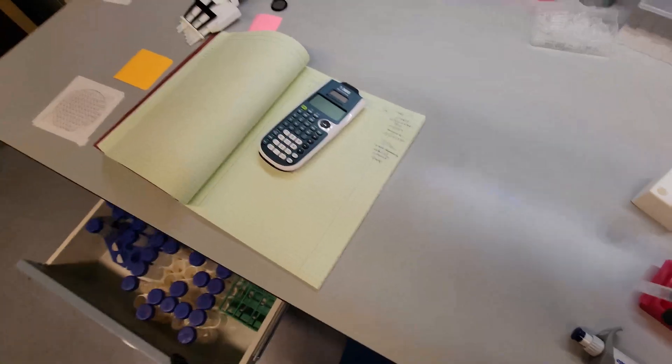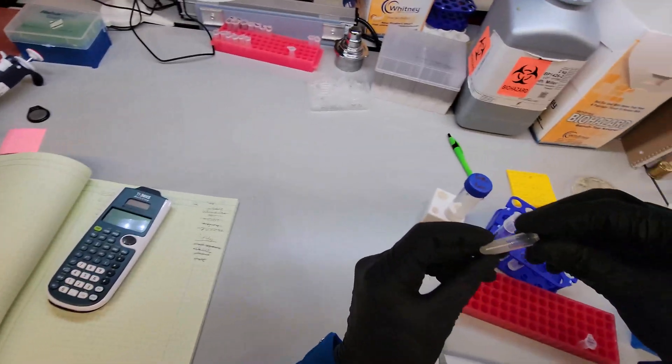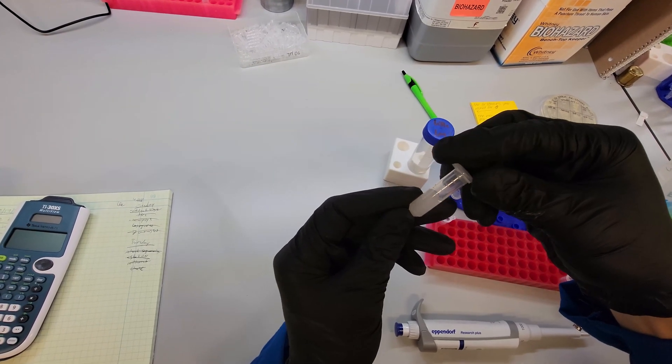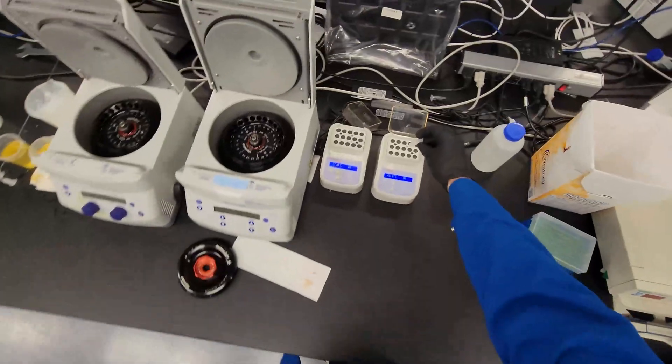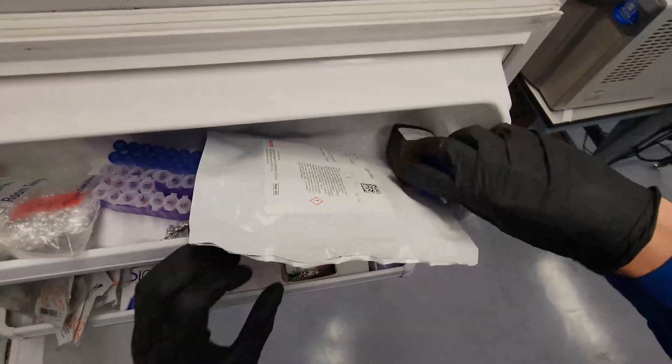See, it's a pain to dissolve. So we'll throw it in a heat block. And I think that's pretty close to 857. It's about as close as we're going to get. We'll get that melted. So we need DTT.